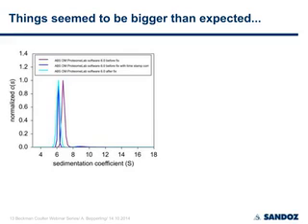When we did our first experiments on the newly acquired Proteome Lab software on our machine, we saw that the S value shifted slightly of about 10%. Masses were always higher, about 170 kilodalton for a monoclonal antibody.